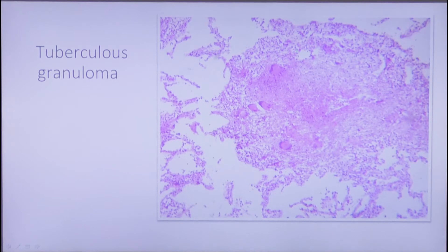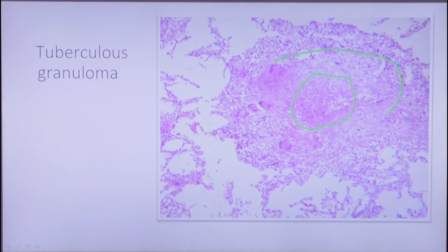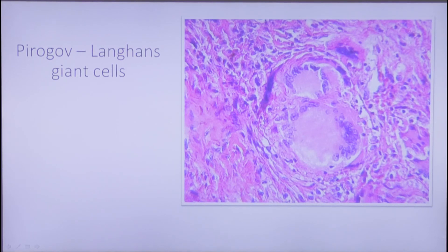Inside a tuberculosis granuloma we always see an area of caseous necrosis surrounded by transformed macrophages called epithelioid cells, with lymphocytes and plasma cells. Some of these macrophages can group together and form Pirogov-Langhans giant cells. These are special multinucleated cells whose nuclei are situated on the periphery of the cell, arranged like a horseshoe. Thank you for your attention.